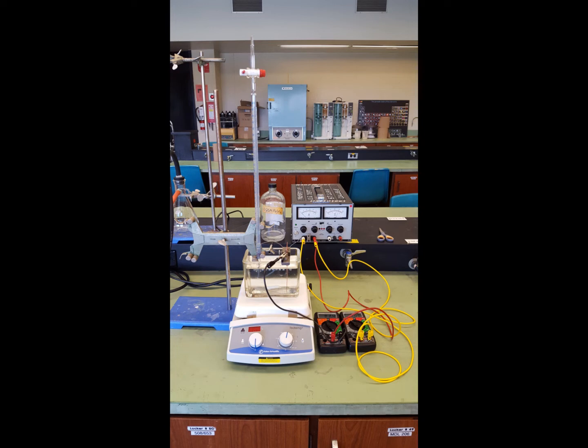This short video will explain the setup for the Faraday's constant experiment. So a Faraday is simply the charge, the electric charge of 1 mole of electrons. And if we can measure the number of electrons transferred during an electrical experiment, then we could calculate the number of moles of chemical that's oxidized or reduced during the experiment.